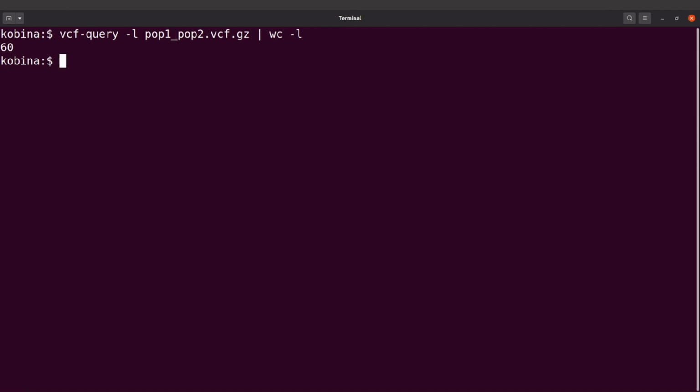That is where naming convention also comes in handy, because if you have a good naming convention, then you can use some Linux commands to get these populations into different files. But we will look at them. First of all, let's just look at the samples again. I'll use this command this time.